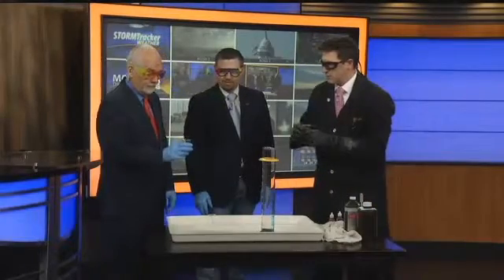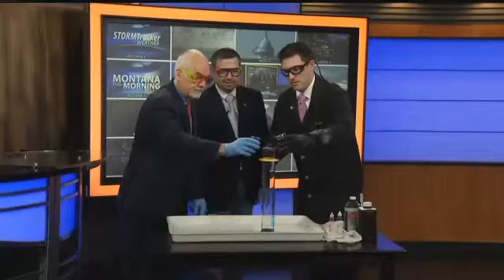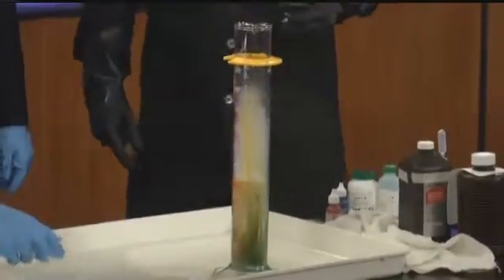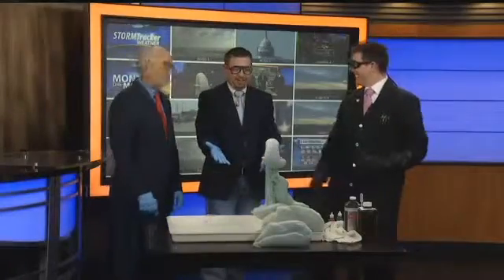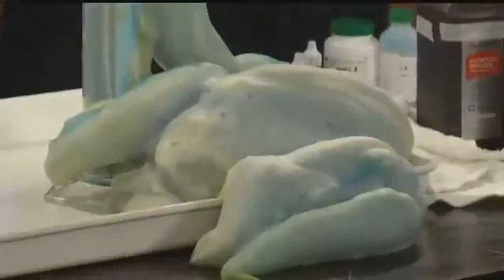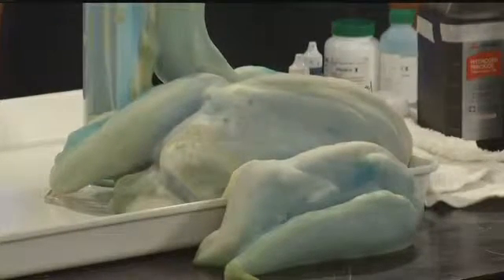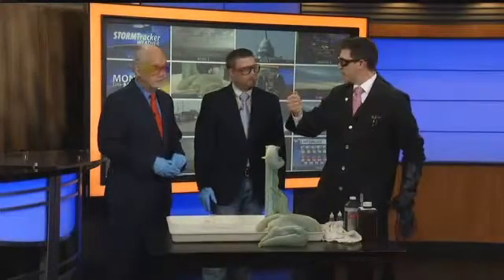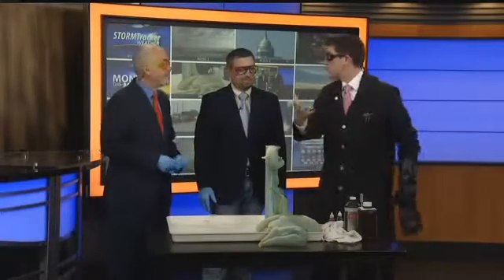Swirl that up just a little bit. On one, two, three — we'll watch this hydrogen peroxide decompose. One, two, three. Wow, look at that! A little science cocktail. That is some elephant toothpaste! It's the same thing that was happening on the liver, only much more quickly and with a little bit of soap involved. Decomposition of hydrogen peroxide — now we've got elephant toothpaste. This is hot; this is an exothermic reaction, so there's a whole bunch of heat coming off of here. If we had a flame — which I didn't bring one for obvious reasons — this is all oxygen, so we could basically stick a flame in there and we'd just have a nice flame come off the top.